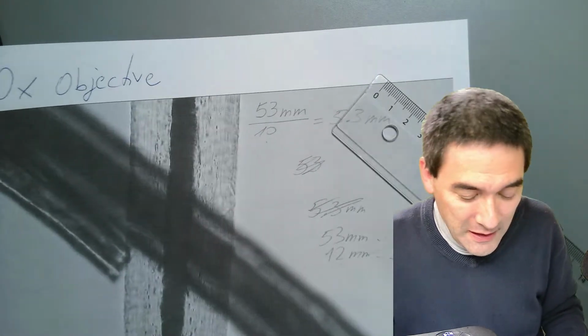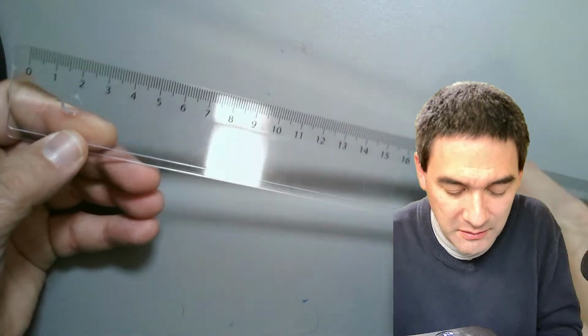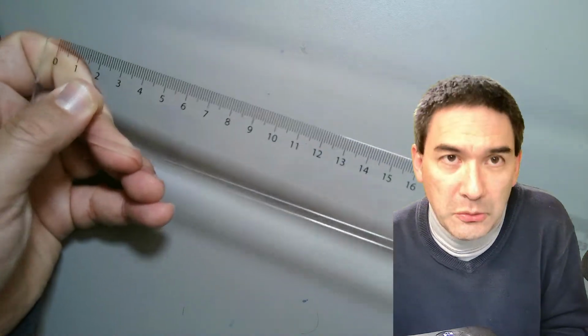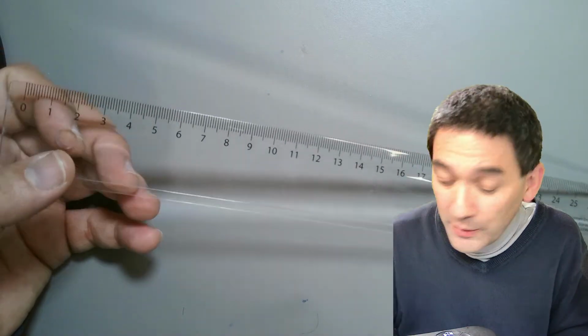I just wanted to show this to you because I at least consider it interesting and relevant to use a regular ruler also to make measurements under the microscope. So I want to move on.